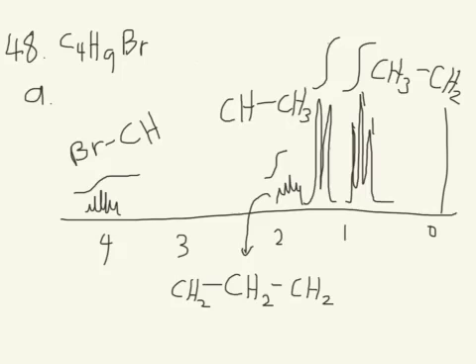But it could also be a CH3 and a CH. And I'm pretty sure this is what we actually have here, because we already know there's CH3s and CHs in this compound, and there's only 4 carbons, so there's just not enough carbons left to have a bunch of CH2s laying around.